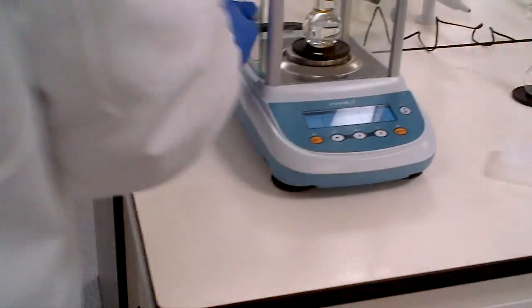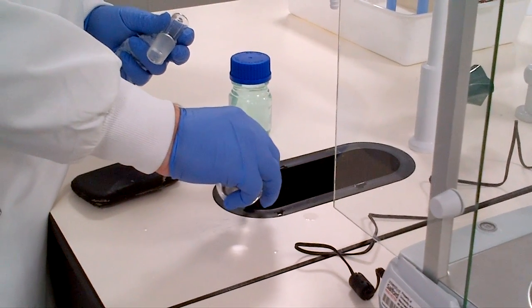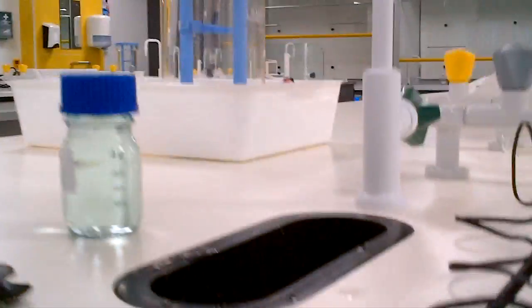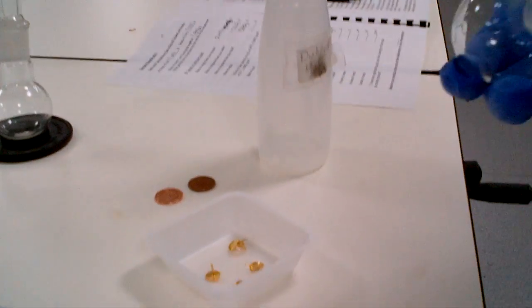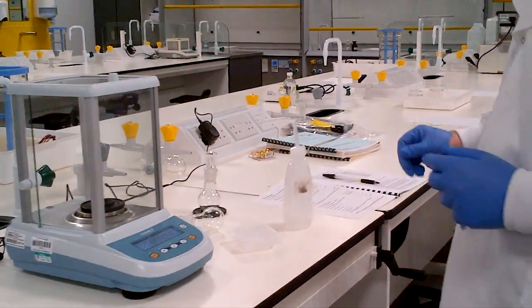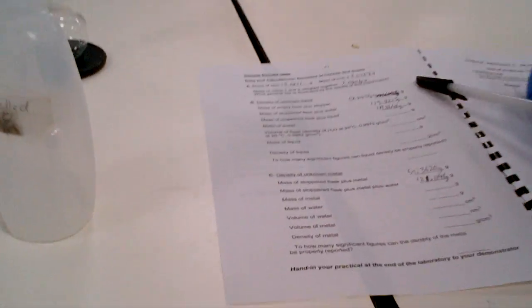So what do we now need to do? What you've done with the water, this is just water. So again, carefully make a choice to decant down to there, and then pour out and tap out into the weighing boat. You've now done your practical. You've now to take your appropriate values and work through your sheet.